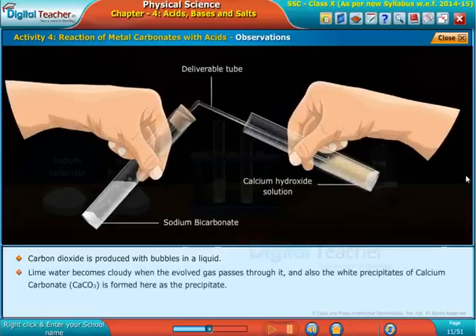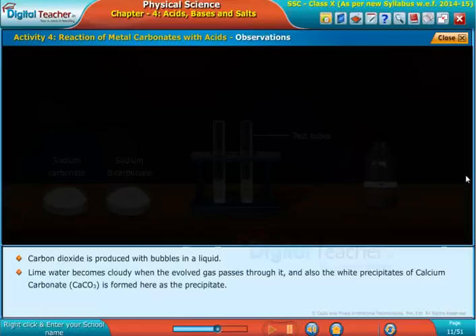The lime water becomes cloudy when the evolved gas passes through it, and white precipitates of calcium carbonate (CaCO3) form as the precipitate.